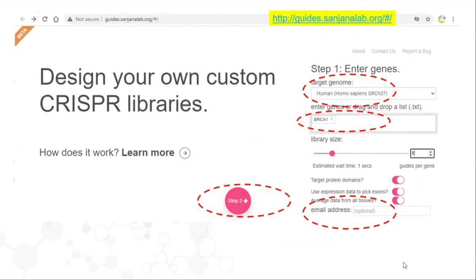Now coming back to this portal that I was showing you, guides.sanjanalab.org, here you can do some really interesting stuff. You can design your own custom CRISPR libraries. How it works is you select the target genome, then you enter the gene or drag and drop a list in a text file, and then you select the library size. You select how many guides per gene you want. I've selected 8 here. You're free to select 5 or 10 or whatever.